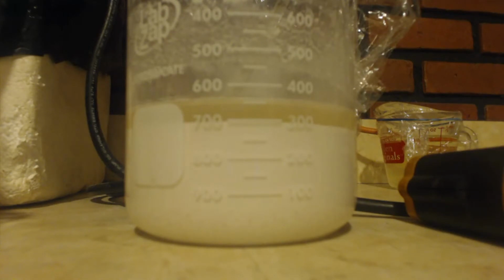So you need something that's not going to react or dissolve in the pot. You know what I mean? And this would work. But magnesium sulfate is not a good idea. It's just going to dissolve inside the water.